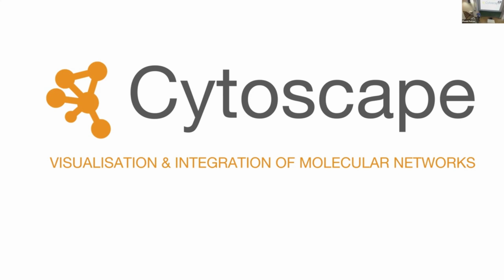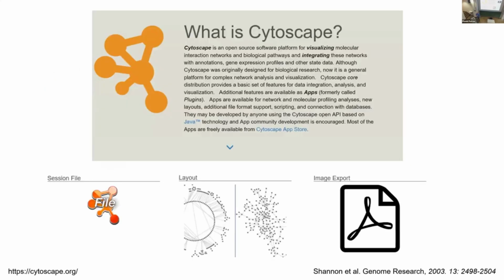So this is supposed to be very hands-on. But okay, so Cytoscape is an open source tool, and it basically allows you to visualize networks. It's very much used in genomics and other omics sciences, and it's a fantastic open source tool for network visualization. In my opinion, the best one I know of. I don't know if you have other recommendations.